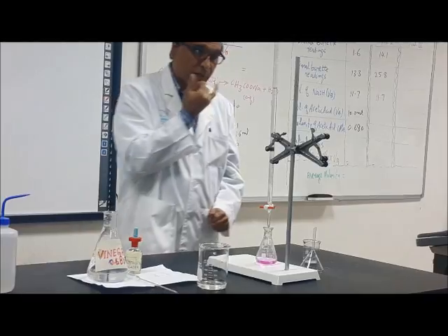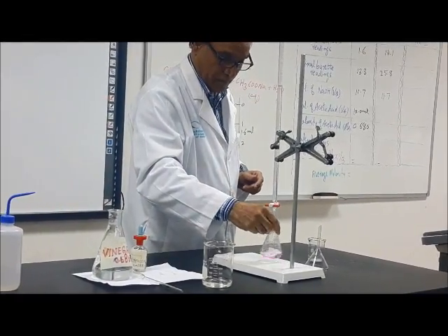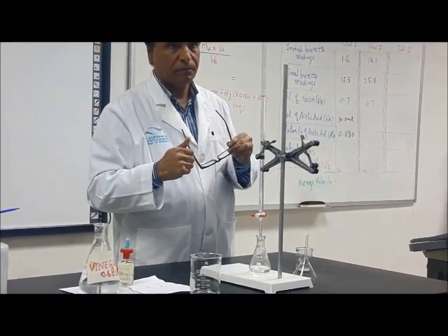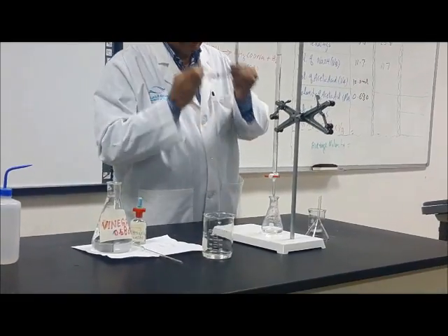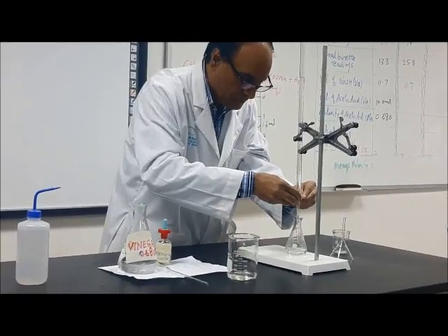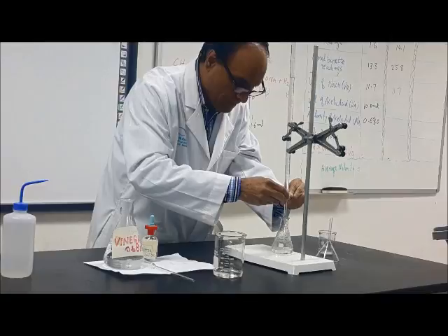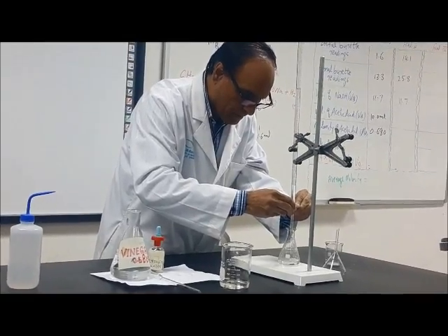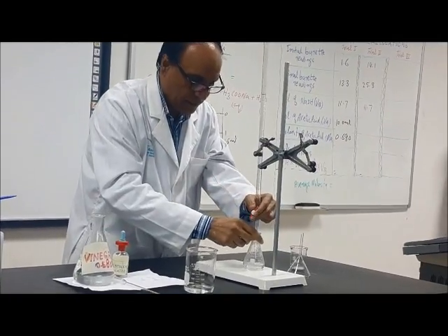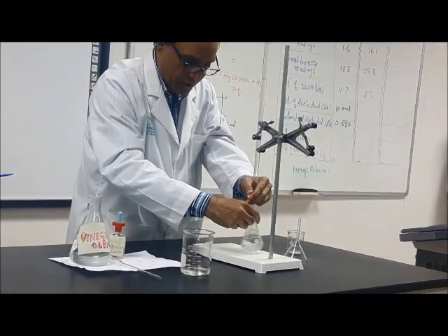So, is it the end point? You need to check. No. Okay. Now, what I will do? Now drop wise. Twice. Yeah. So, careful and add. Like this, and I will move it like that. One drop at a time. Do you see that? Yes. One drop at a time.